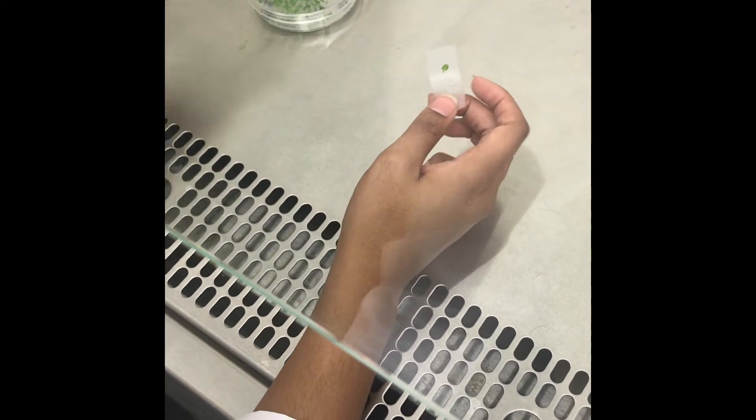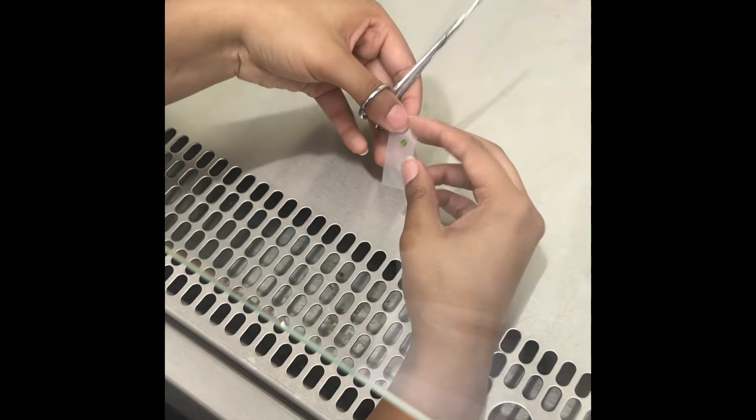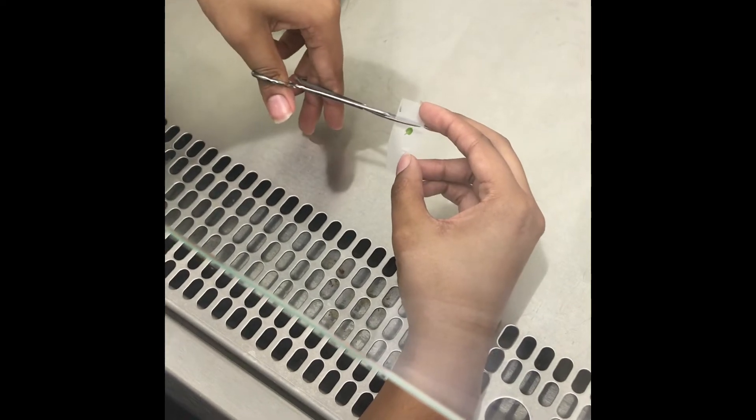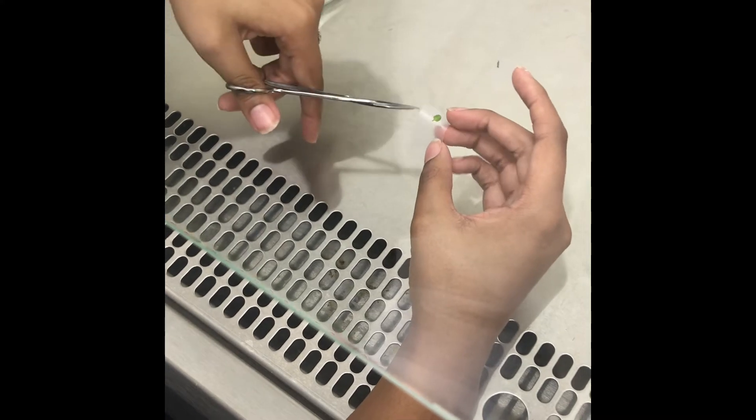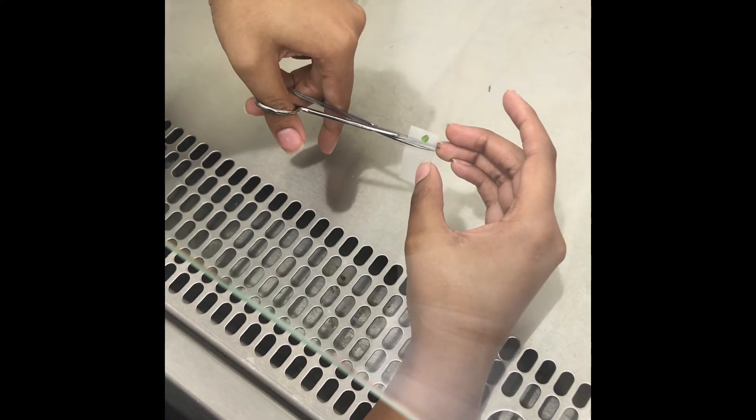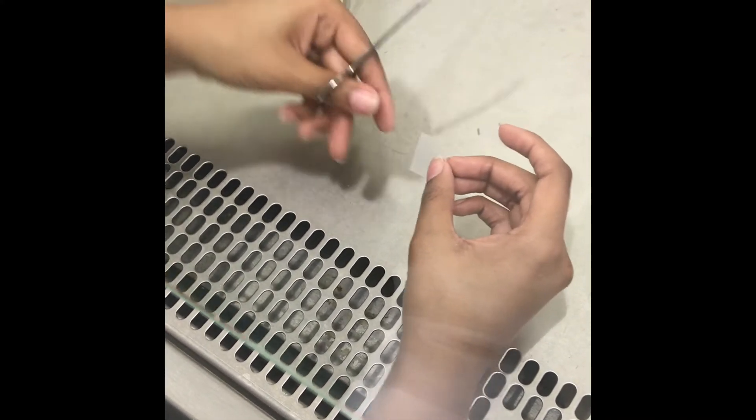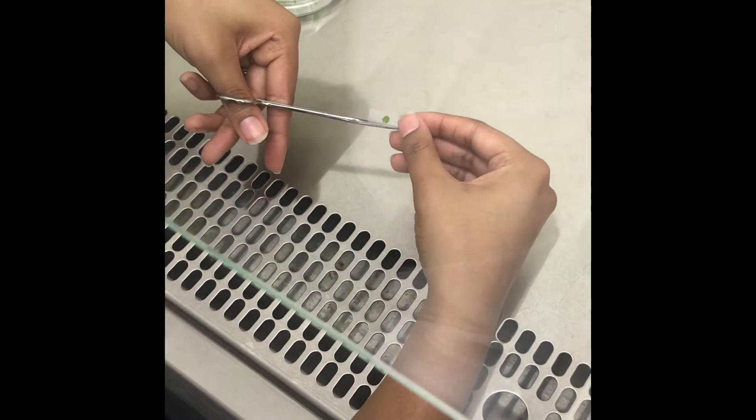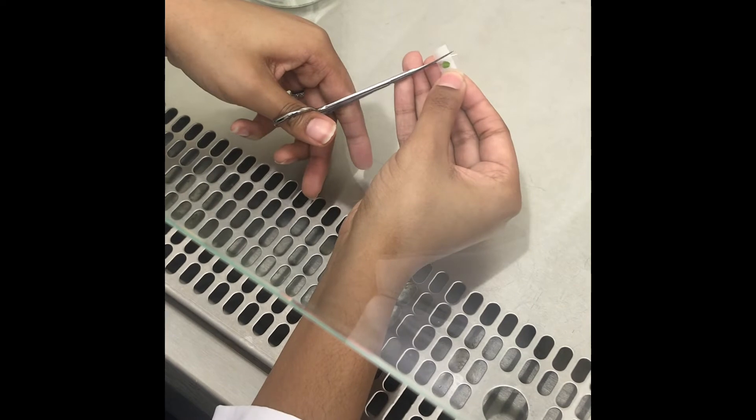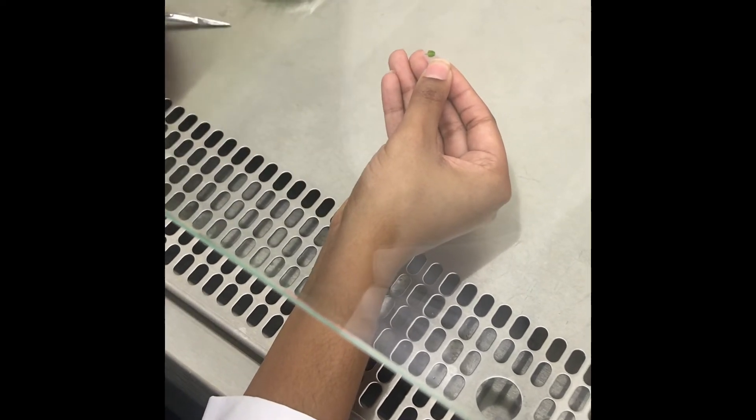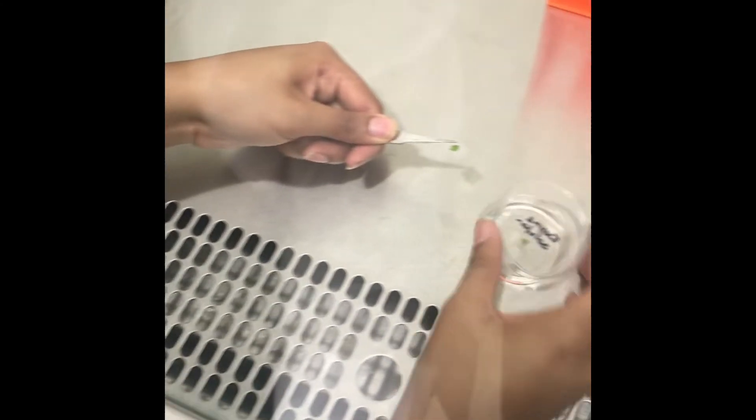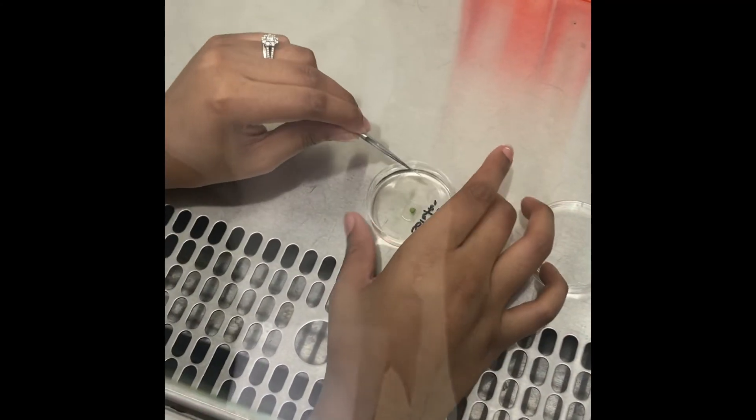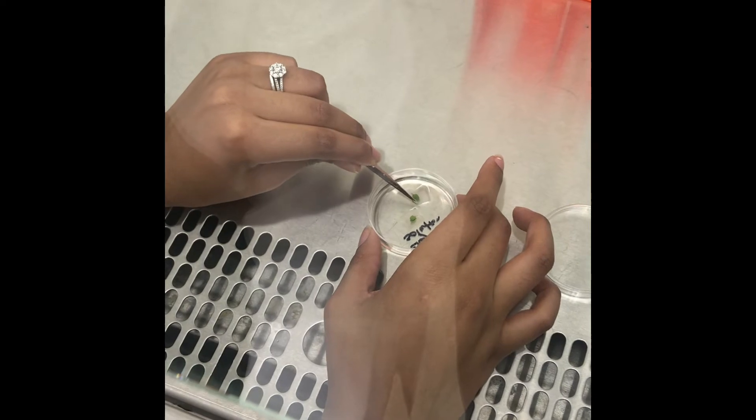So we'll discard the thinner layer and then with the remaining layer we will cut it and place it in the enzyme solution with the cells facing towards the solution.